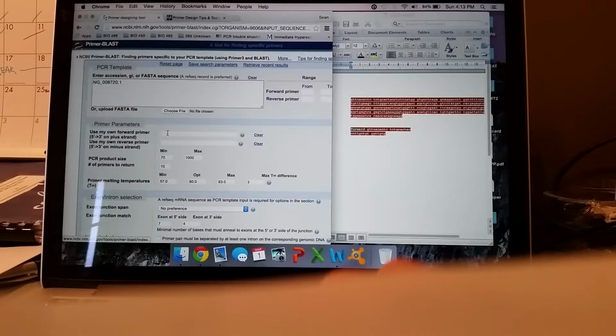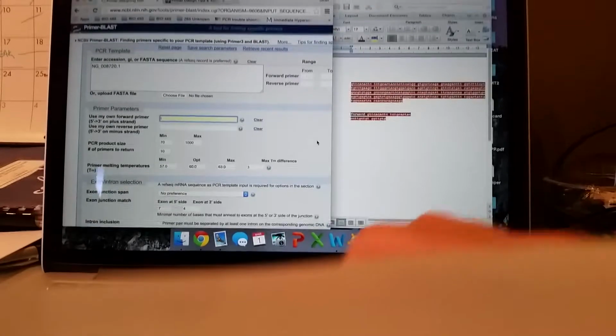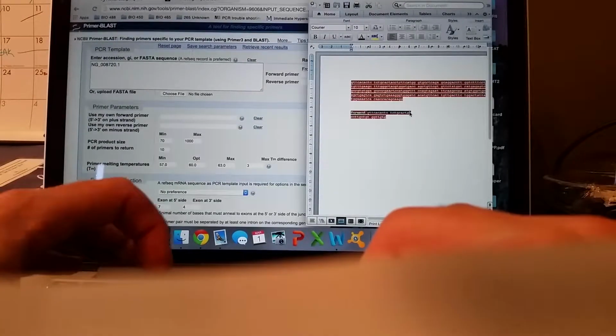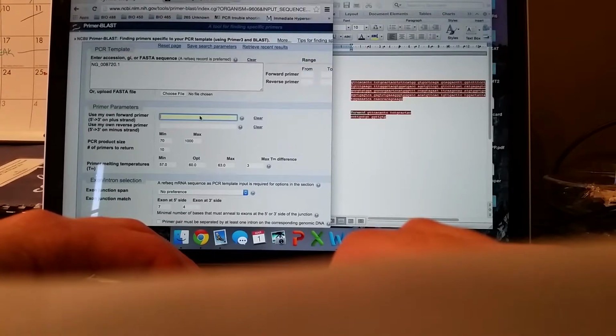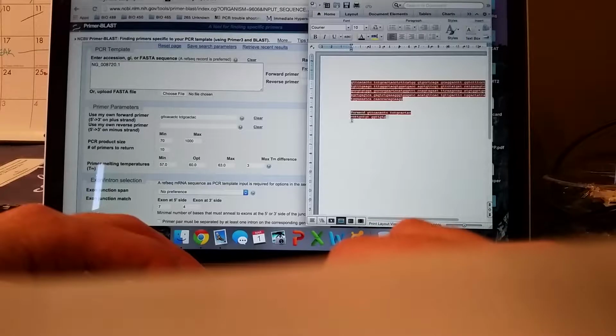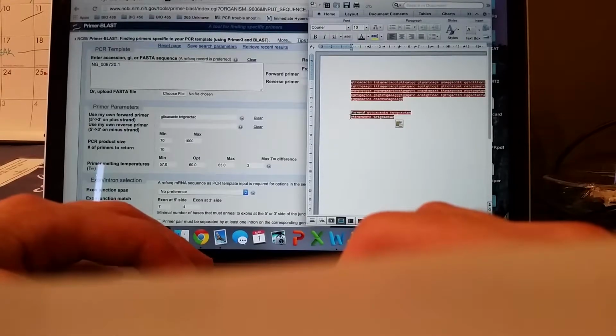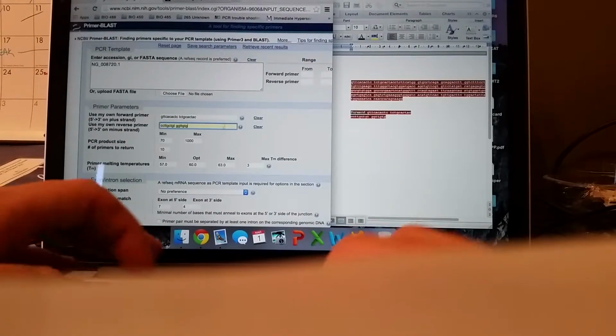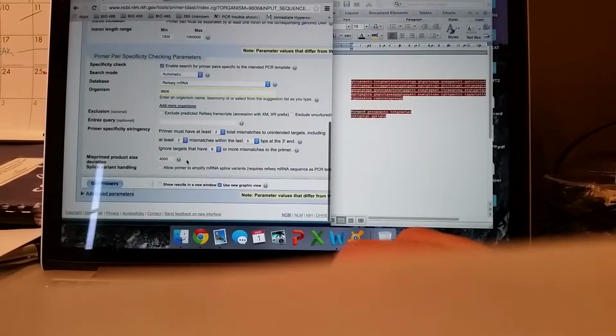So go to pick your primers. Say that you want to use your own. So take the sequence that you've got over here and do it less sloppy than I am. In a lot of cases, I've ignored the brown stuff, and I think maybe when I deleted that, some of it disappeared. You're going to want to be more careful than I'm being. I'm just doing it quickly to show, so you can actually get primers for this.